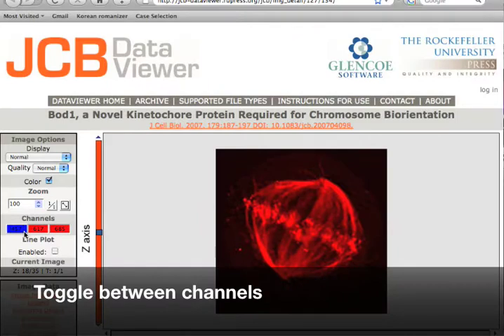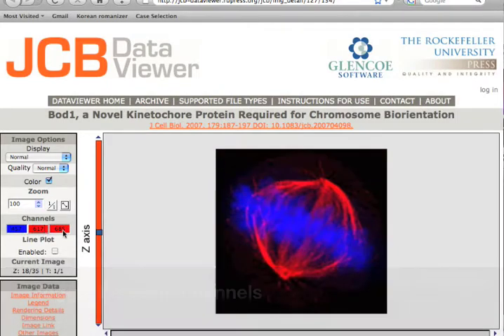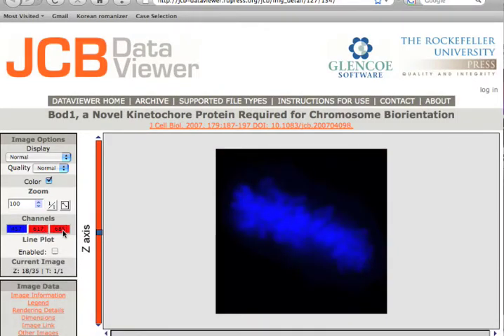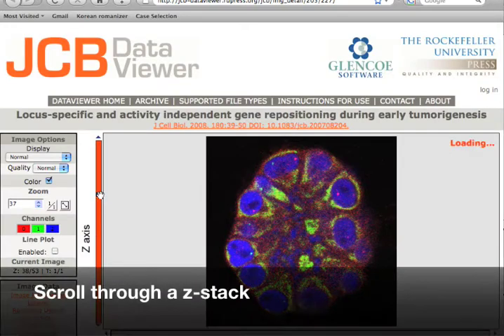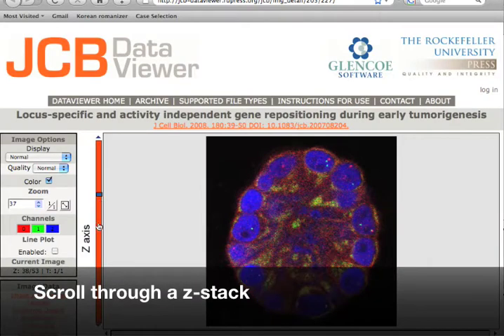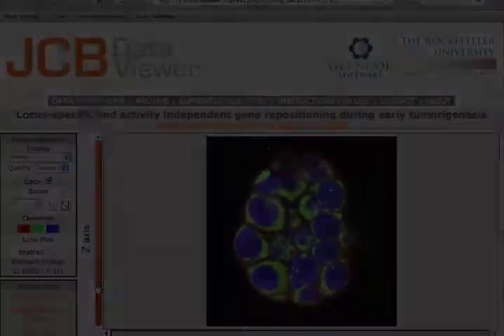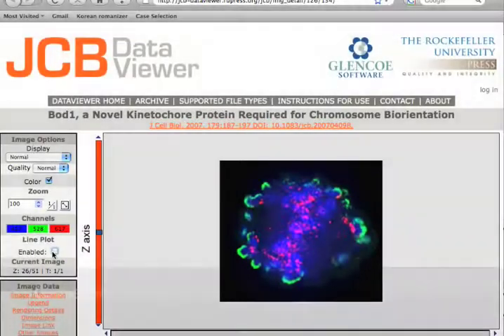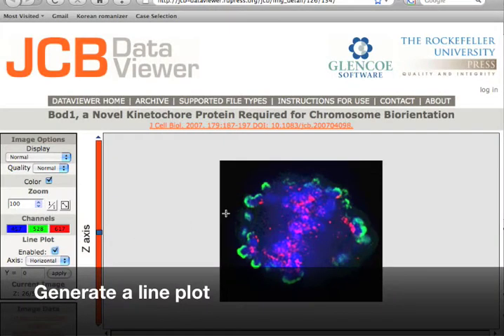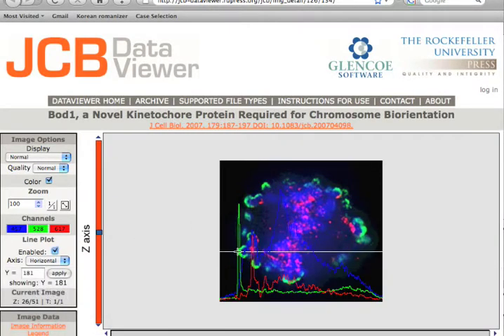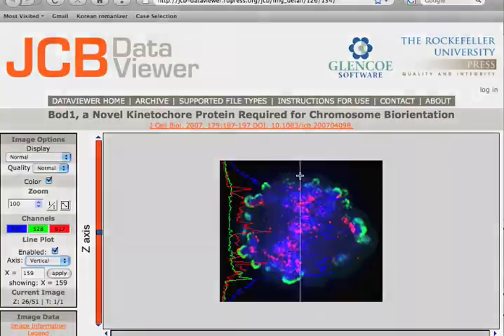You can change the channels on the image, move through a Z-stack, and you can even generate a line plot to look at the color intensities for an axis of pixels that you determine.